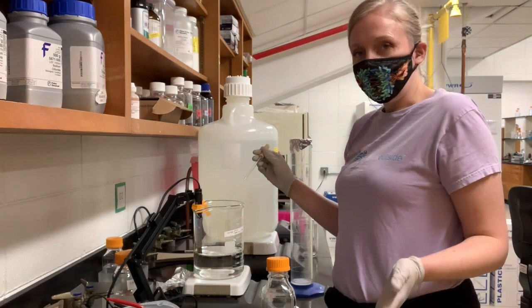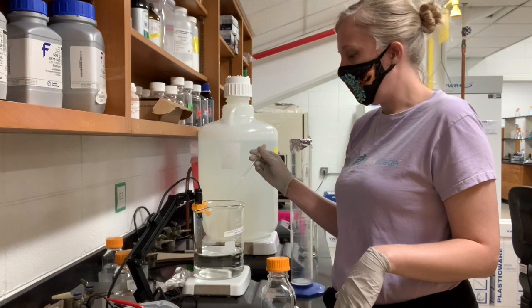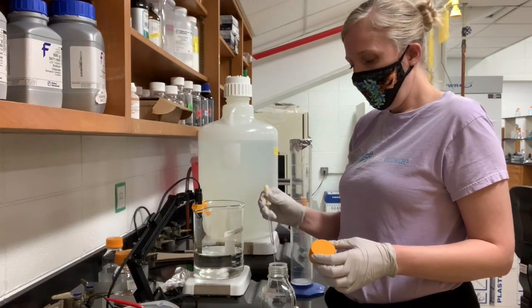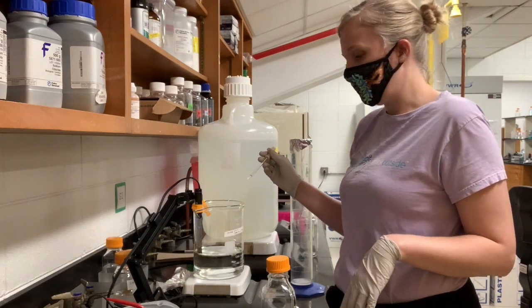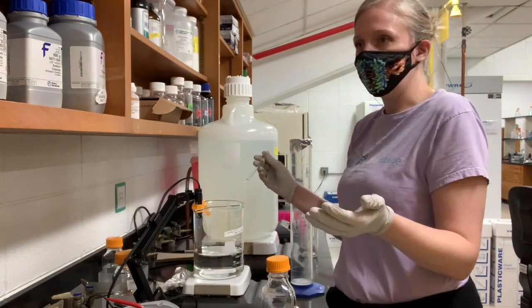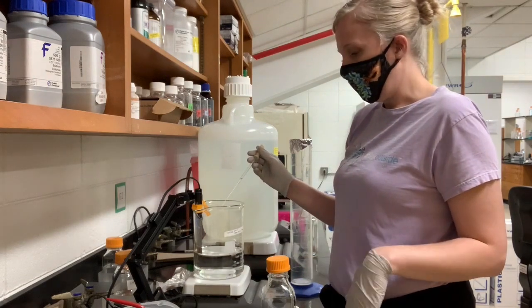There are some solutions that if you overshoot the pH, you can actually ruin them though. So I think it's a good practice to start being really careful and intentional about pHing solutions, going slowly, being as patient as you can. And this will help you to just be a better chemist when we're making solutions, so that you're more likely to have all of your solutions be correct. If you overshoot and overshoot and overshoot, the pH may end up being okay, but you've added a lot of other ions as well, and that may actually alter a little bit of the properties of the buffer that you're making.